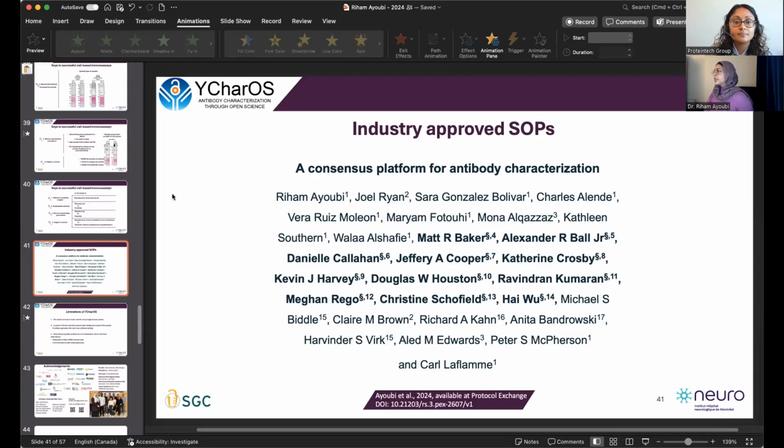The YCharOS mission is now focused on commercially available antibodies that are accessible to everyone. So I assume in her case, it's maybe a custom-made antibody or an in-house antibody that she developed in her lab because she couldn't find a suitable antibody that's commercially available. So right now our focus is on what's accessible to others rather than selected products that may not be as accessible. Okay, great, thank you, if that answers the question.